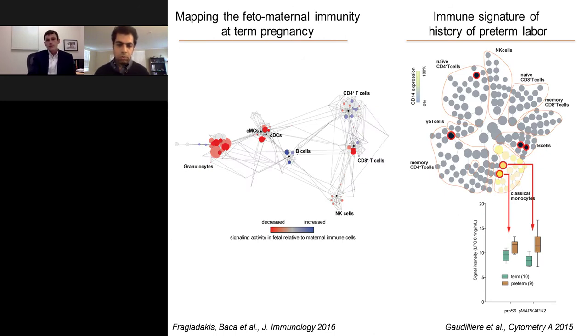Now, in order to visualize the high parameter mass cytometry data set, there are several algorithms that exist, that all use more or less the same idea: to cluster the different immune cells using the phenotypic markers, based on their phenotype, and allows us to build comprehensive maps of the immune system. So now there's SPADE, there's Citrus, viSNE, Vortex, one of the last clustering algorithms that came out.